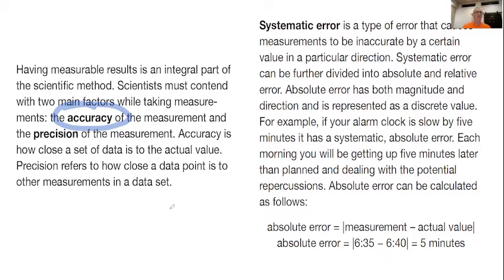So if you're weighing something or taking the mass of something that a very, very accurate measurement beforehand said is 12.5689 grams, for instance, and now you were using one of our scales that doesn't have that kind of accuracy.